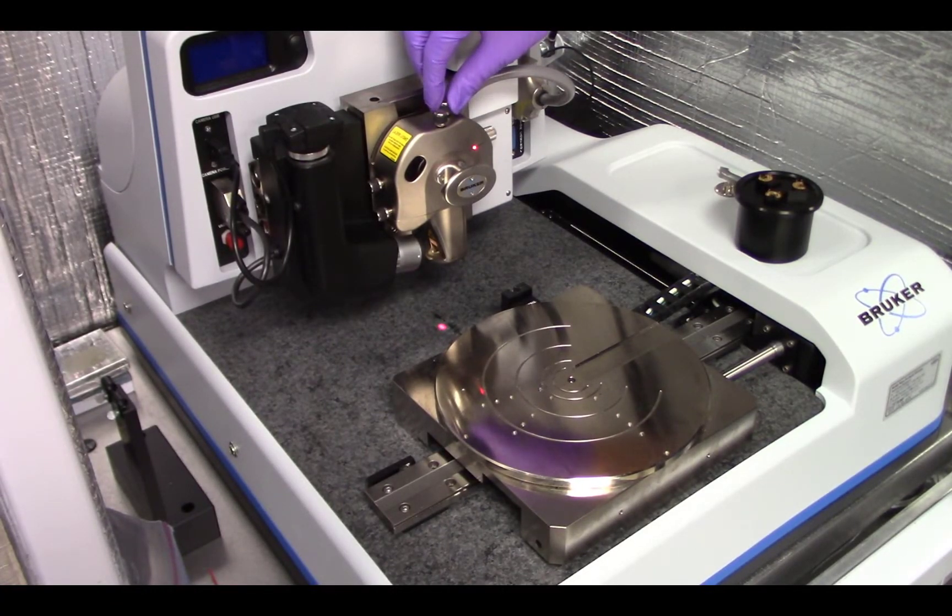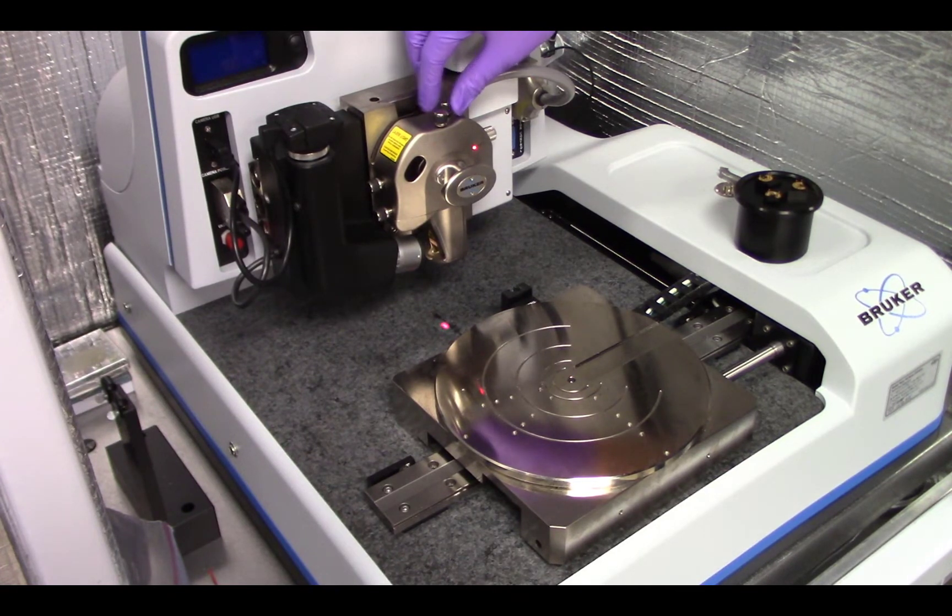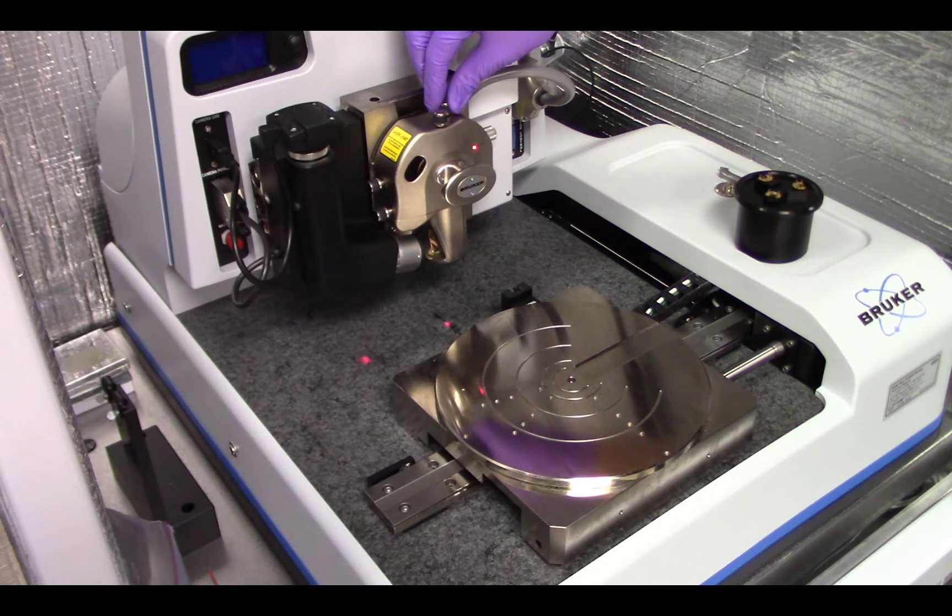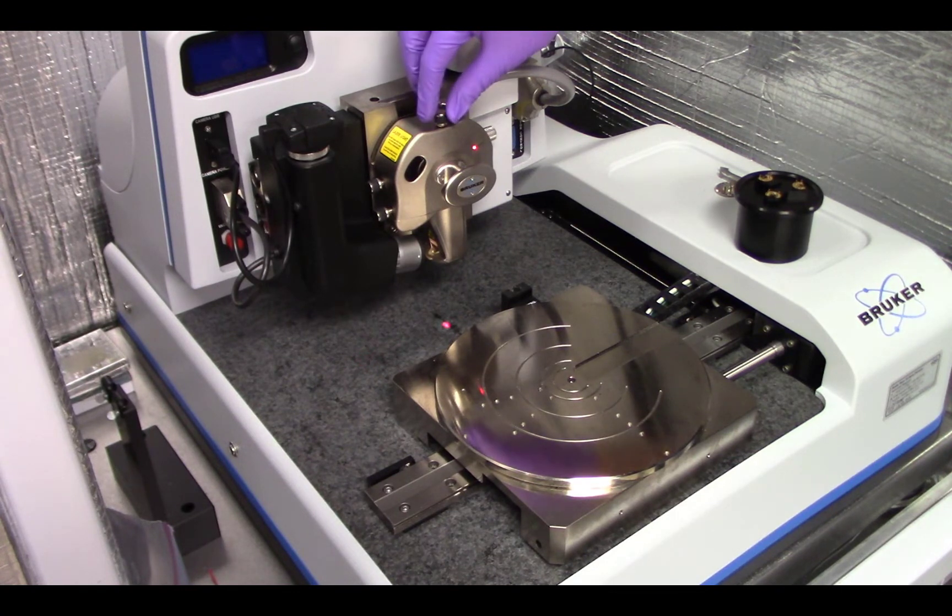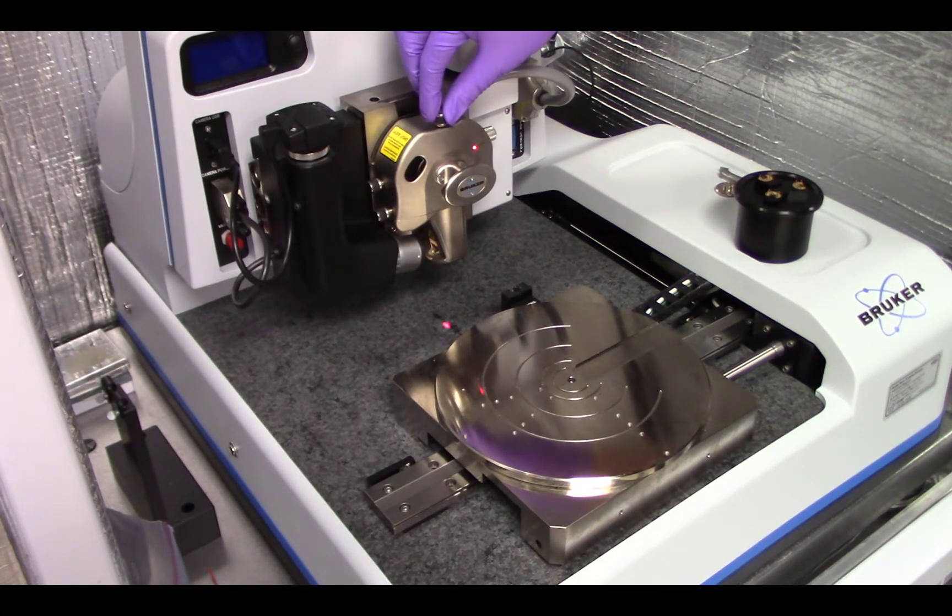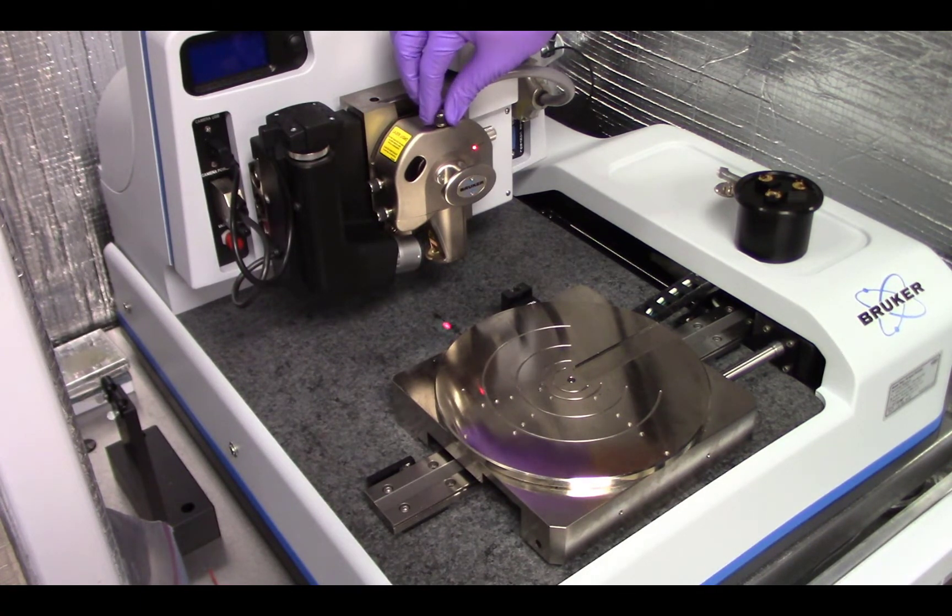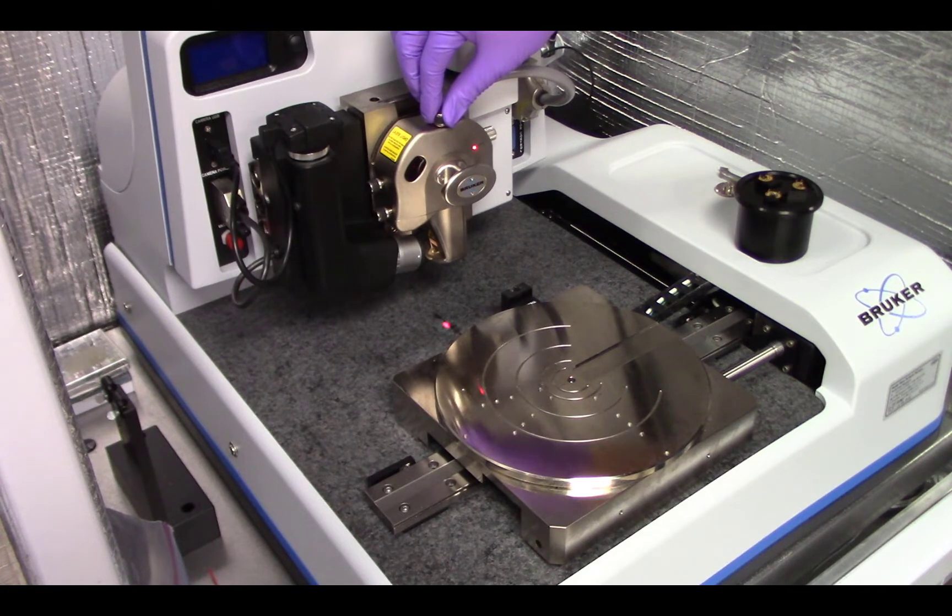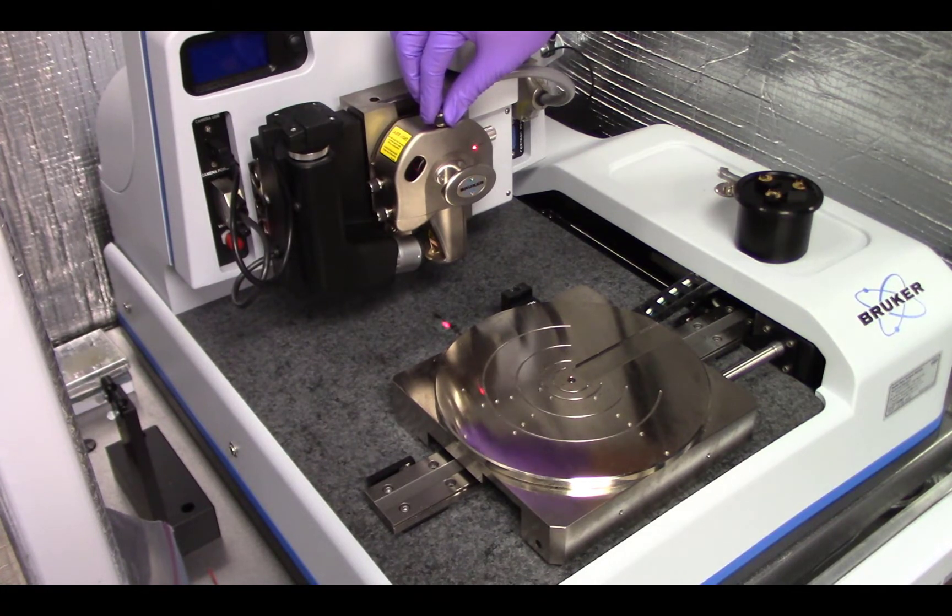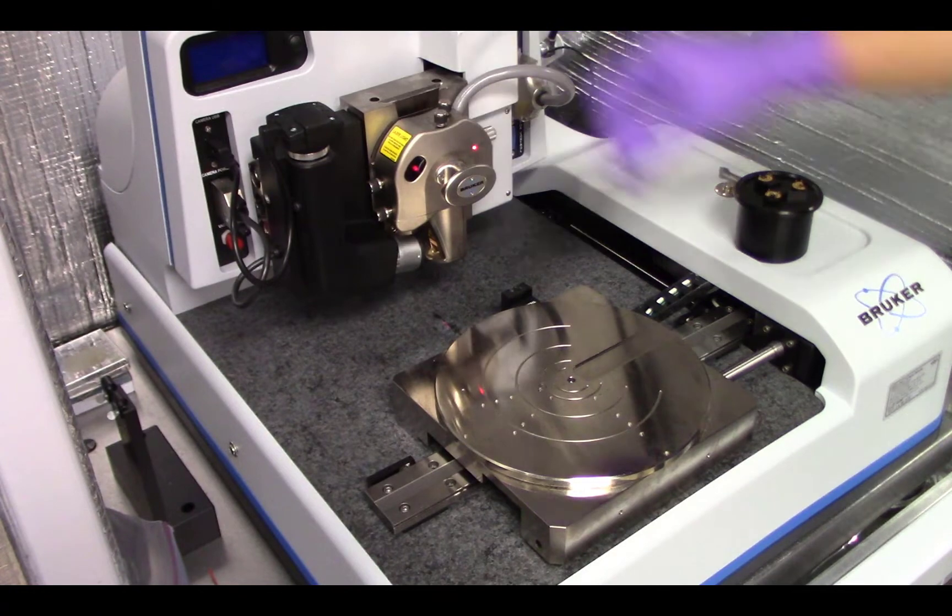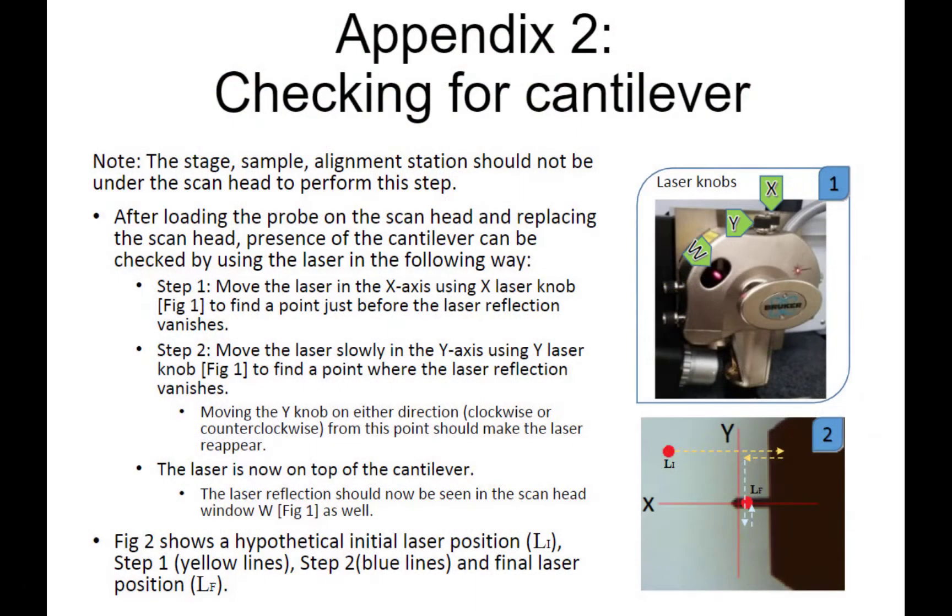Adjust the x-axis using the laser knob to find a point just before the laser point vanishes. Now, move the laser slowly in the y-axis using the y-laser knob to find the point again where the laser spot vanishes. Moving the y-nob in either direction from this point should make the laser reappear. This allows you to confirm that the laser is now on top of the cantilever because it is blocking the laser spot.